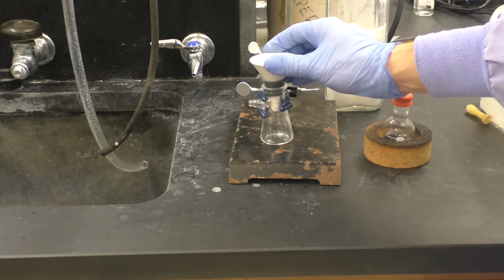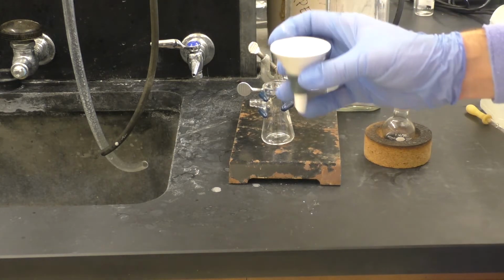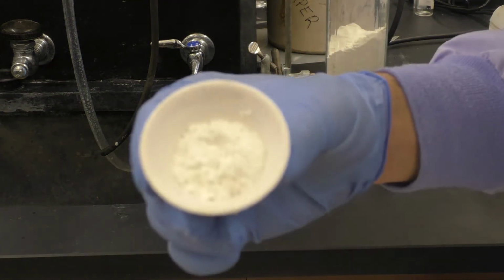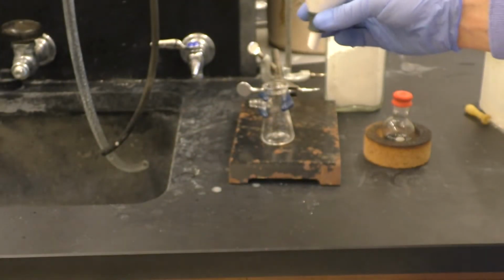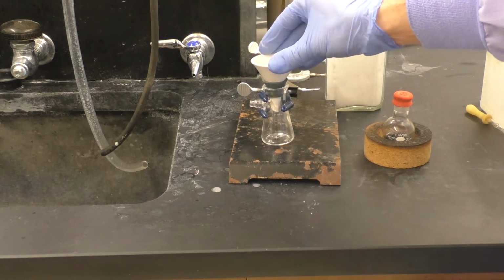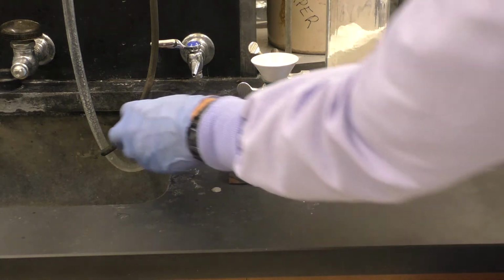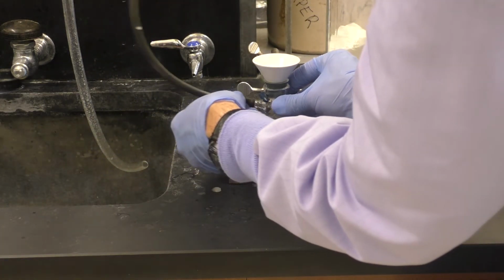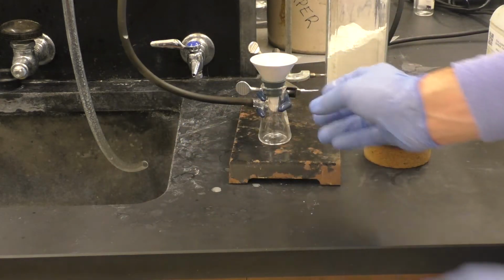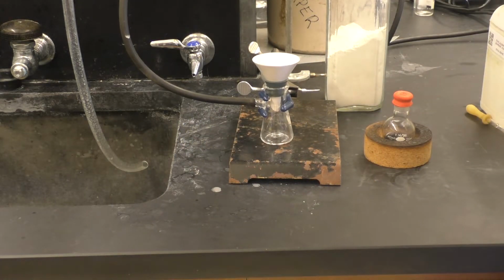Pull this off here so you can kind of see. You might be able to see a little bit that pad of Celite there that should catch the palladium and carbon as it travels through. I'll connect this up to the vacuum adapter here. Turn on the water aspirator.